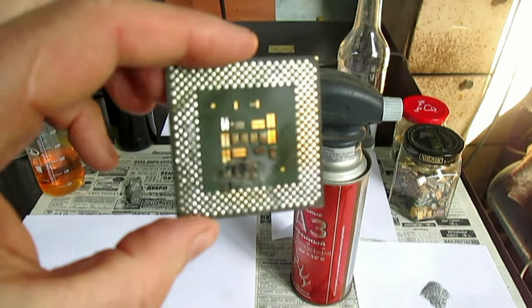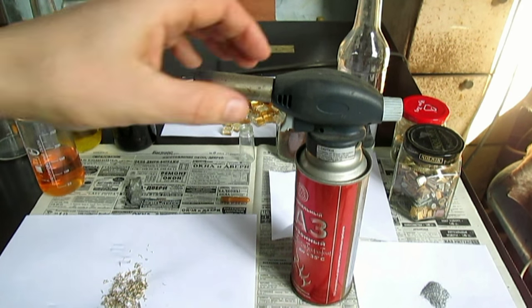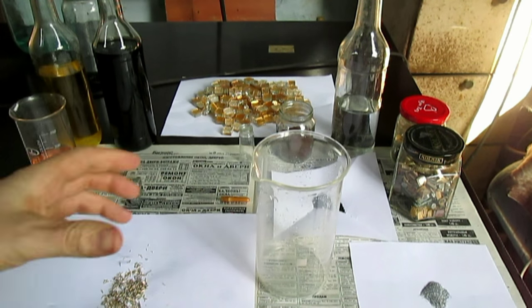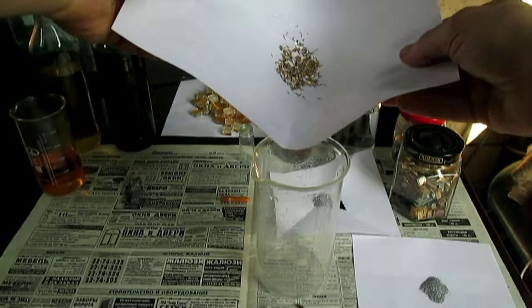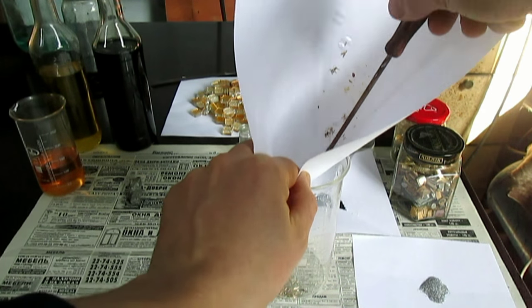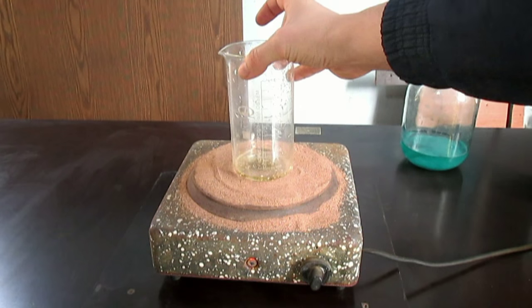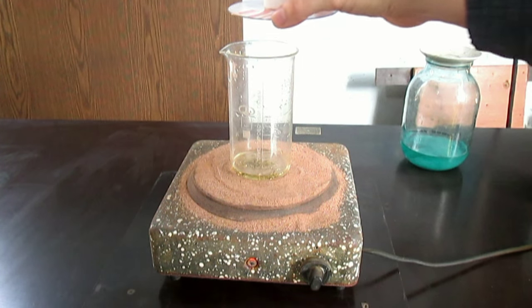Процессоры я обжёг, всю позолоту снял, контакты. Можно их выкинуть. Стаканчик, наша позолота, контакты эти все — мне надо их протравить в азотной кислоте. Ставлю на плитку. Необходимо протравить контакты в азотной кислоте, чтобы одно золото было.